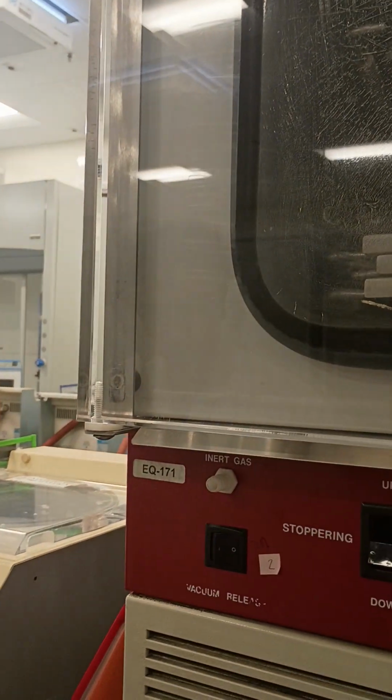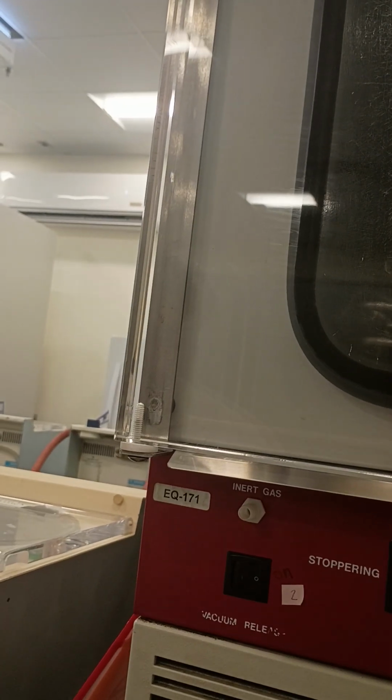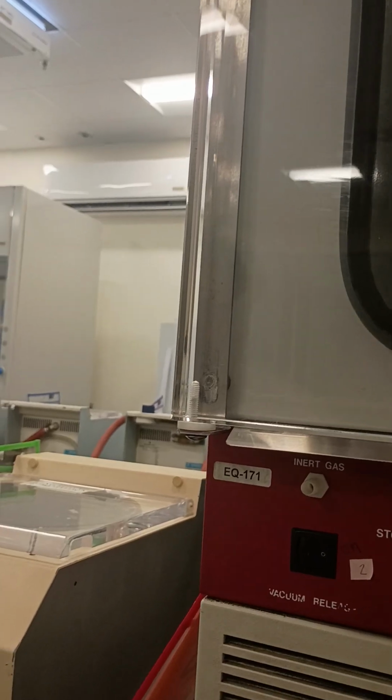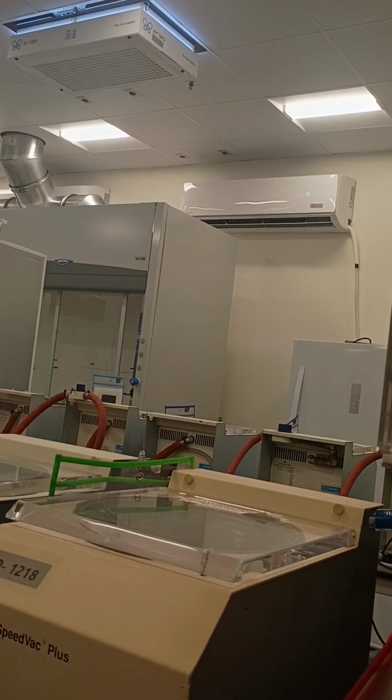When you want to turn on the heat, you see where it says power, you just give it some power. But the principle is the same. You're loading up. This is your vacuum. You turn on your vacuum.